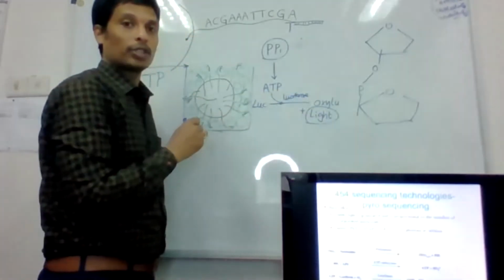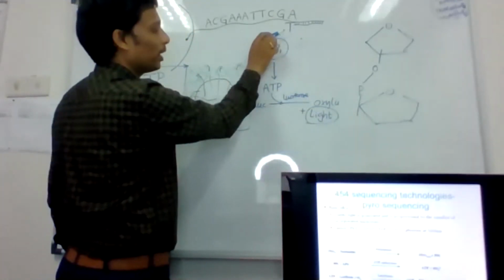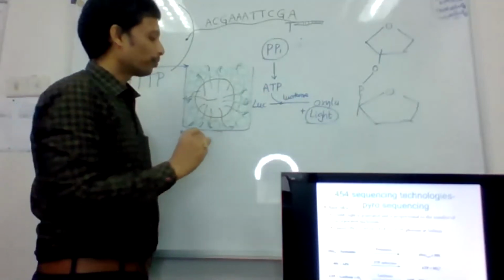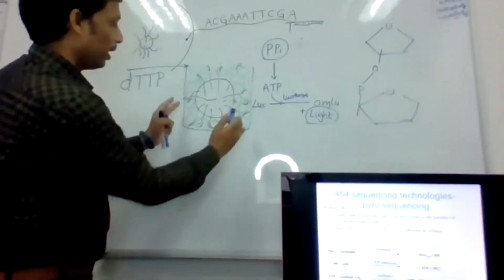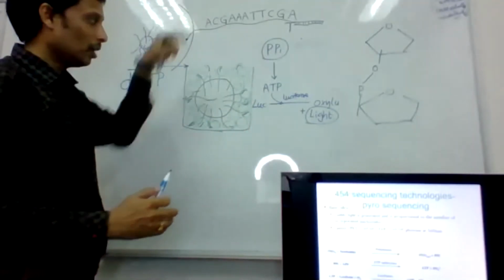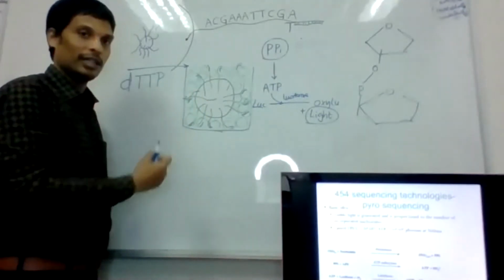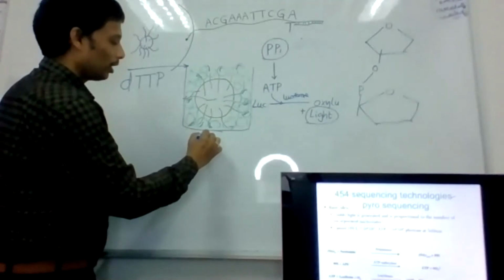Whenever a nucleotide is added, light is released. Then this plate is visualized by a light detector. Whenever any well is releasing light, it will detect and record it.